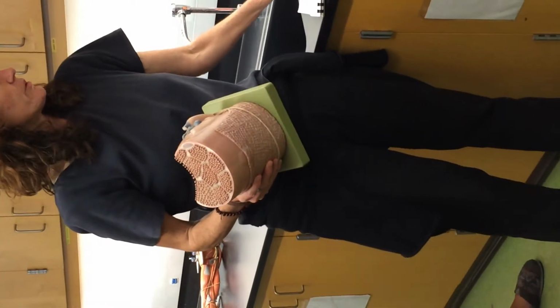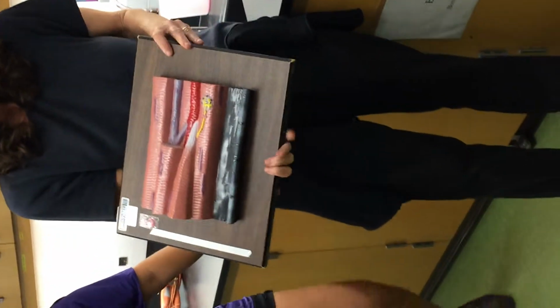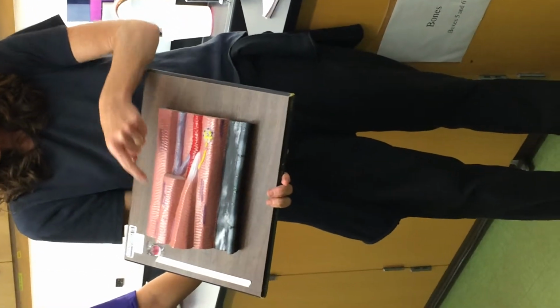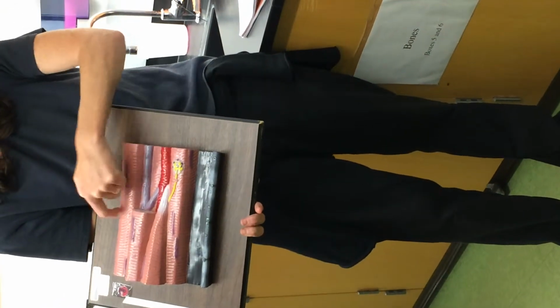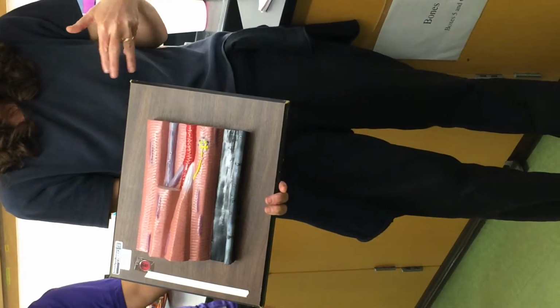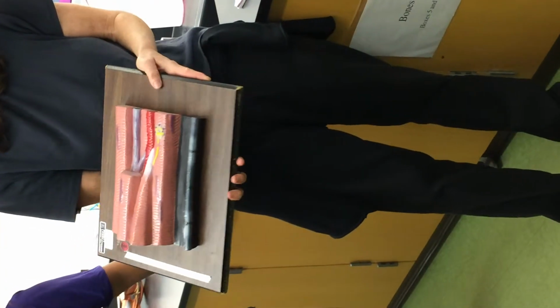Do I have those structures here? I think we do. Okay, I'm going to put that aside right now. Striations, capillaries. So when we're looking at this, first look at the cell shape. Don't you reckon long and cylindrical? Those are nuclei, by the way. So you go long, cylindrical, multinucleated. Can you see the striation pattern? All of that is telling you what type of muscle this is. Close, skeletal. If it were cardiac, it would have intercalated discs.